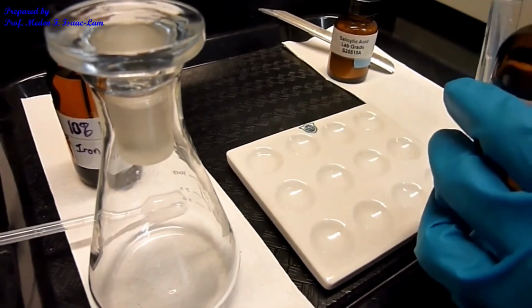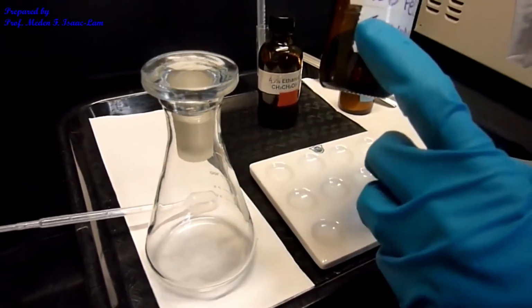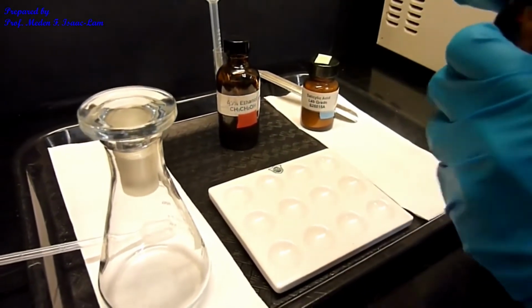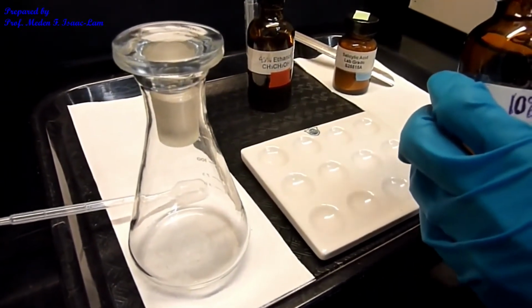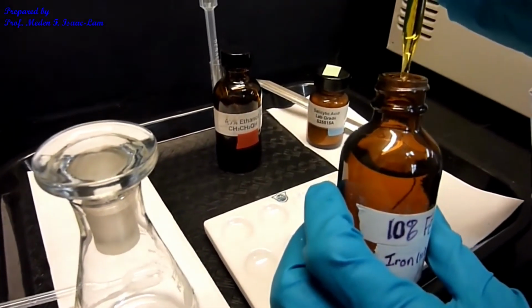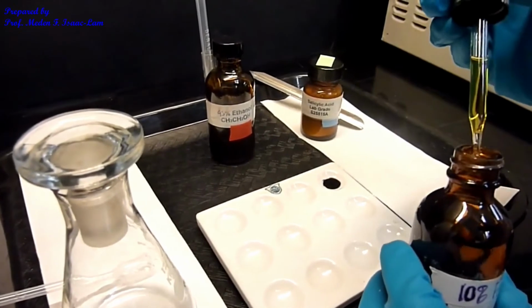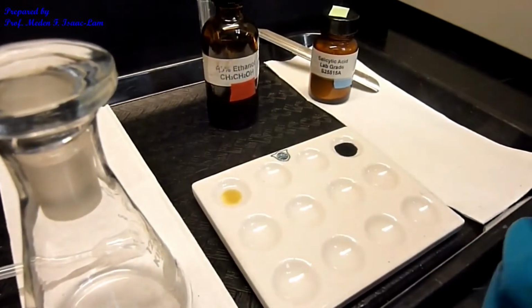And then I'm gonna put a drop of the iron 3 chloride. So the iron 3 chloride, okay, 10% iron 3 chloride, aqueous. So I'm gonna put 1 drop. So this is slightly yellowish in color because of the iron. So this is our starting compound, okay? And then the reaction mixture, okay?